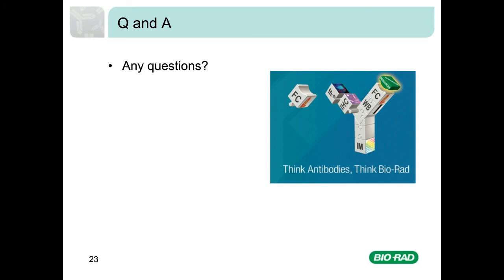Finally, can I avoid compensation? Well, for dual colour staining and small panels, it's possible to avoid compensation providing your cytometer has enough lasers and filter sets. We recommend using fluorophores that are excited by different lasers as a starting point, such as Pacific Blue, FITC, and Alexa Fluor 647. You can add a fourth colour by putting in PE Alexa Fluor 750 tandem. Now have a look at our website, www.bioradantibodies.com/no-comp panels, for a range of panels for human blood phenotyping that use this strategy.